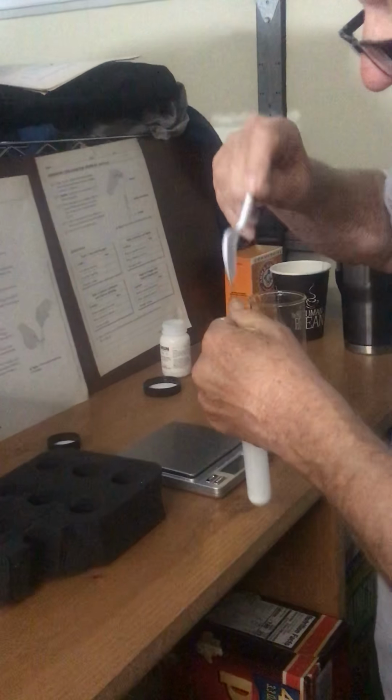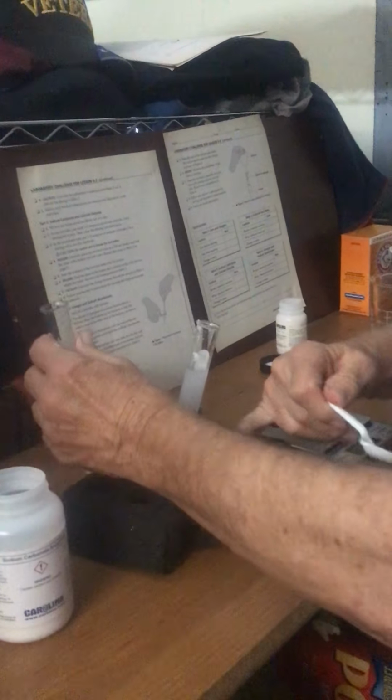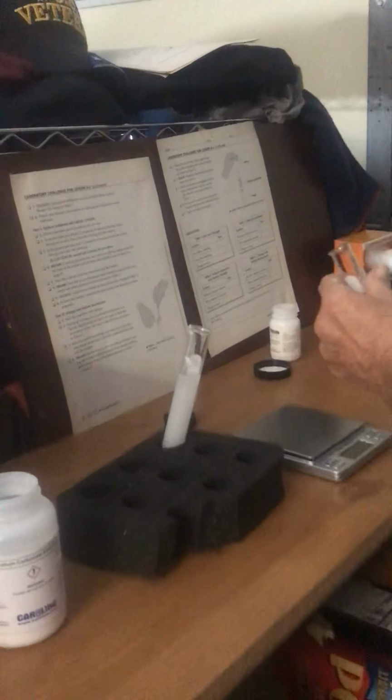Okay, that goes in that test tube. And then into the other one.